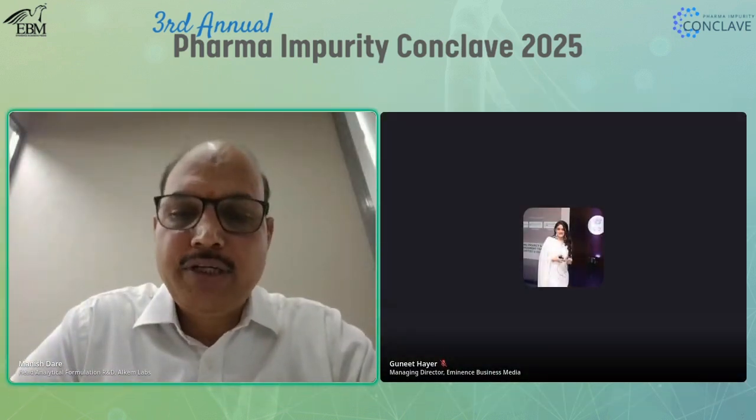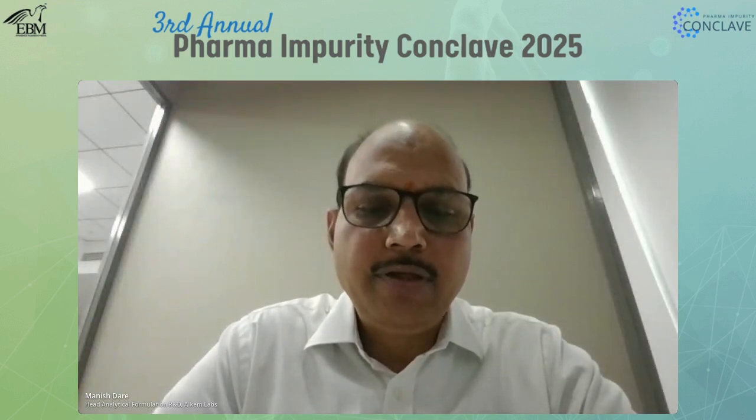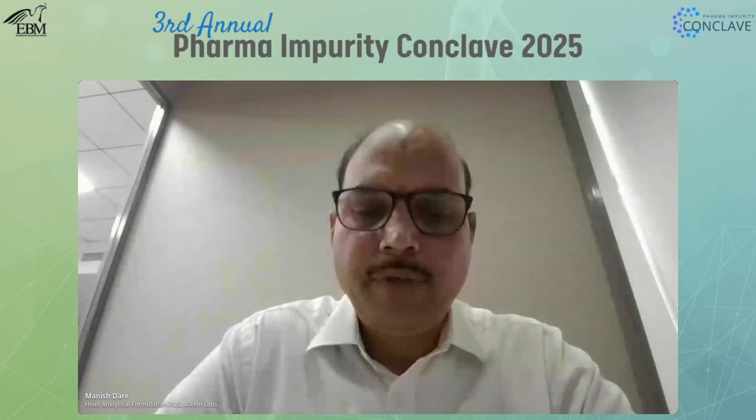So that's why I'm saying this all depends upon the data assessment. During analysis, we have to check whether the particular unspecified impurities are well within the limit or whether they are going to increase during stability. Then accordingly, we have to take a call on making it known.